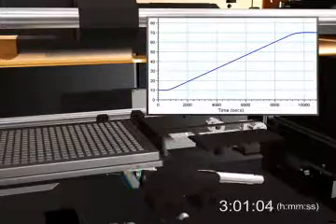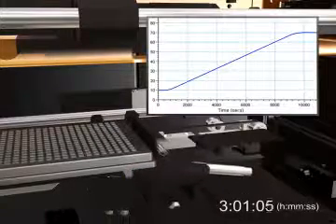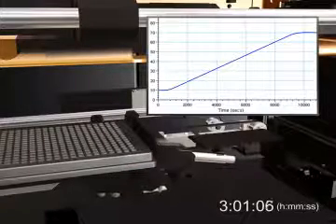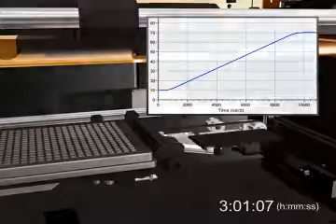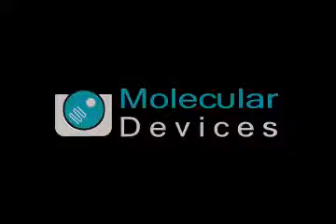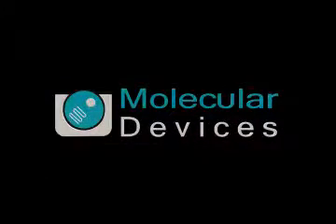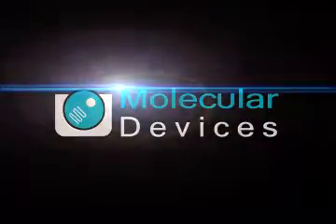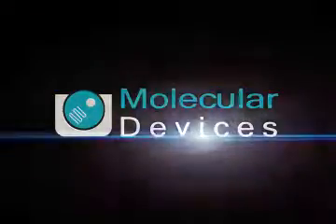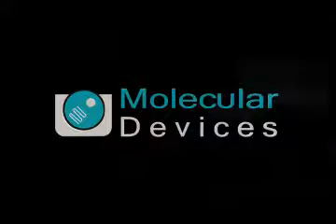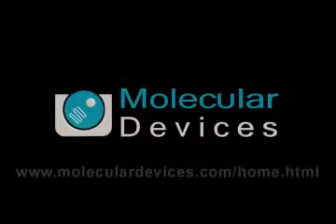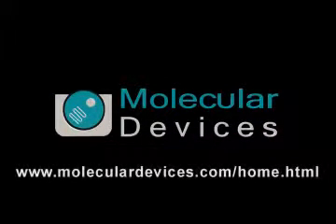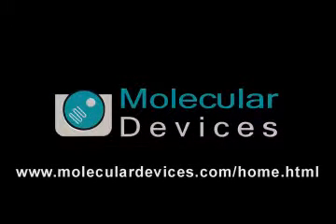The FlexStation 3 multi-mode microplate reader with integrated pipetting enables all of your kinetic and fast kinetic applications in the detection modes you need. For more information, please contact your molecular devices representative.